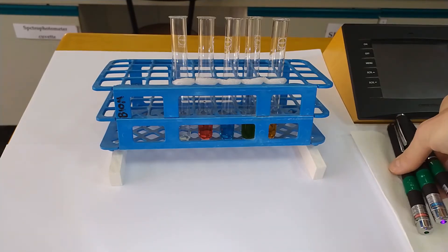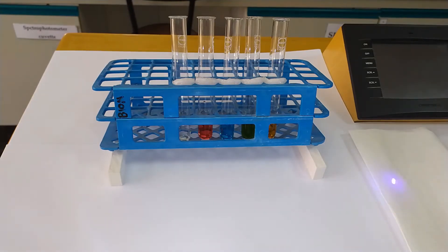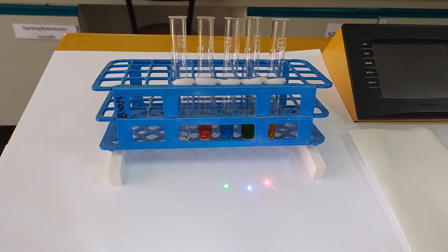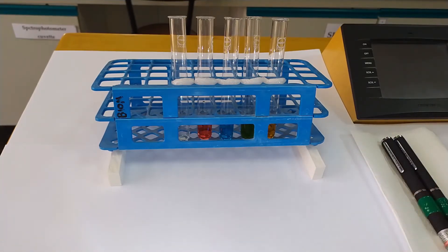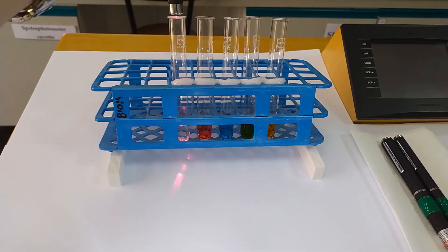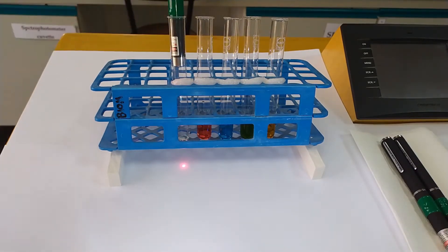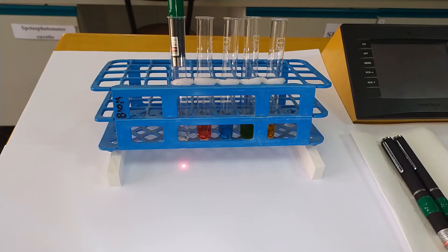I also have three laser pointers with three different light colors. So you can see here that we have three colored dots. And I will be using these to demonstrate these concepts. Let's start with the red pointer. I will place this in the tube with just water. And you can clearly see here the red dot under the tube. So we can say that this light passes through the sample fairly easily.